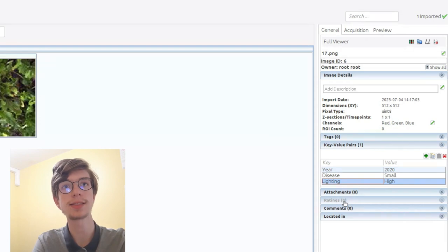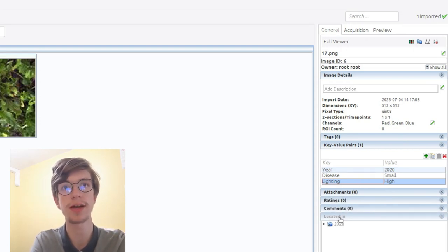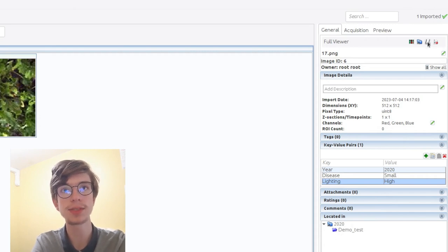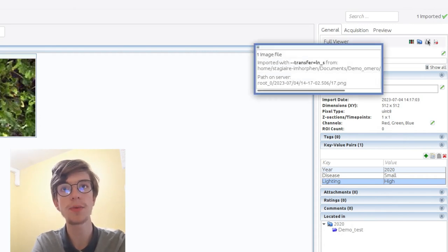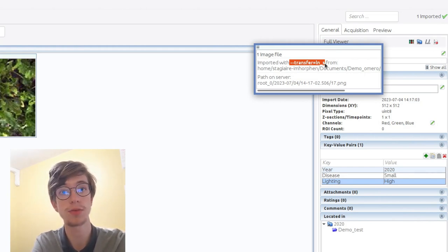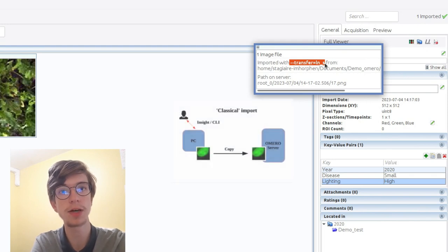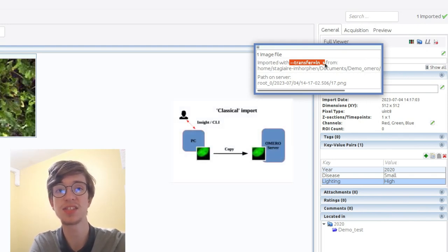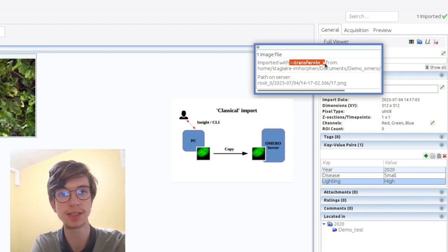You can also add some comments, attachments, and tags, but we won't show that in this video. You can also click here to see how the image was imported, because there are several ways to import images. The default one will copy-paste each image, and this is not very interesting for big datasets.